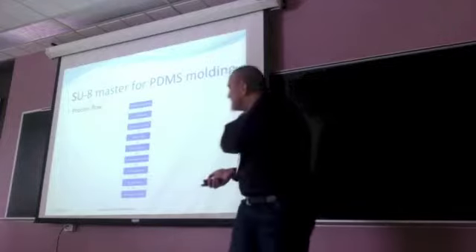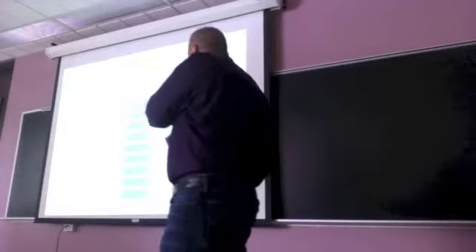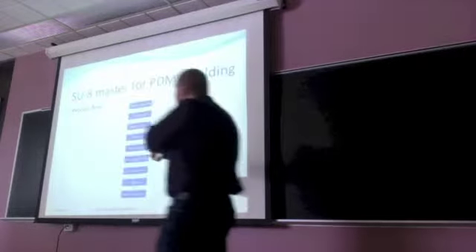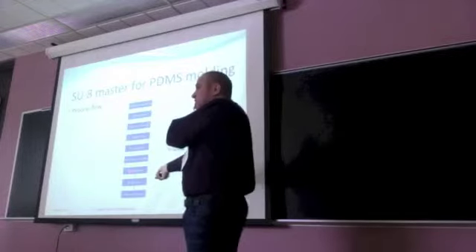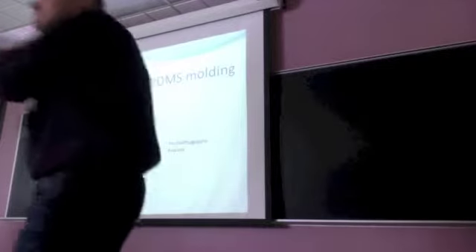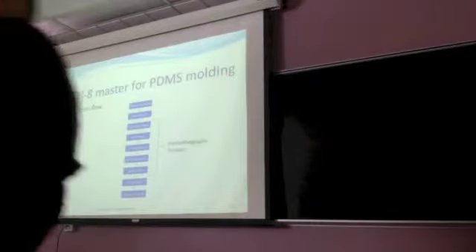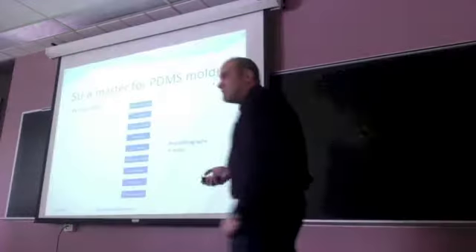It's 3 to 7. Because here, SU8 spin coating, the photolithography process starts here, but you have development. They are not readable. The ones are small. Oh, sorry. I will make it bigger next time. But from step 3 to 7 correspond to the photolithography process.